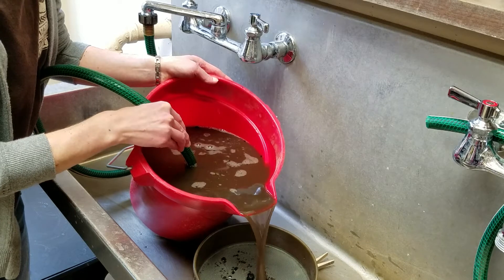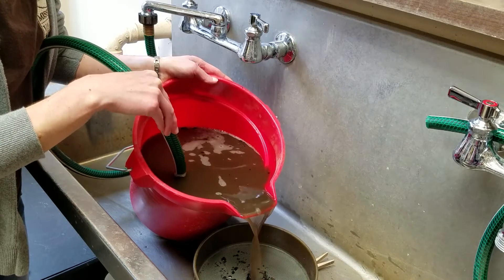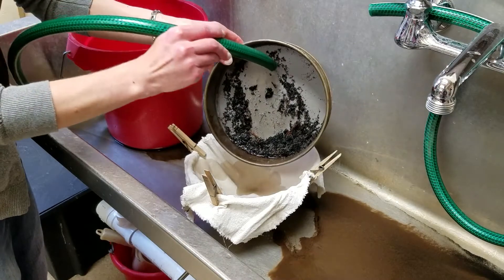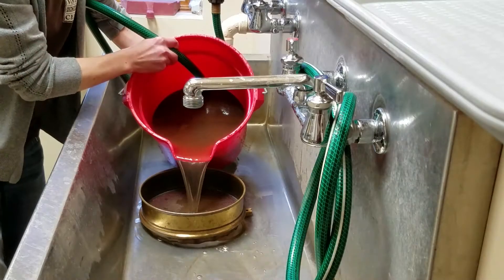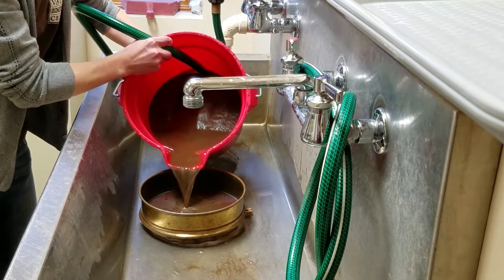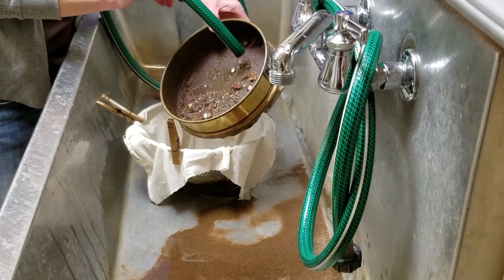The charred plant remains, called the light fraction, float to the top and are poured off into a fine screen. Then they're emptied into a cloth to dry. Next, the remaining soil and heavier items, called the heavy fraction, are also poured into a screen and collected.